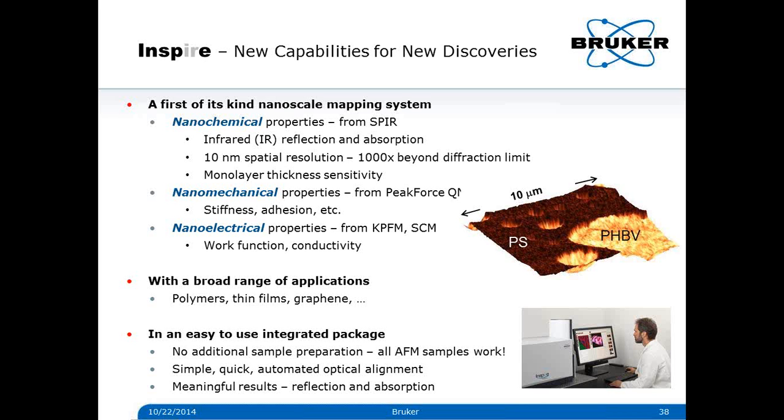One question that came in was about whether this technique would be useful for samples that include polymers with embedded nanoparticles or other objects. So I would say yes. It partly depends on which nanoparticles you are talking about.